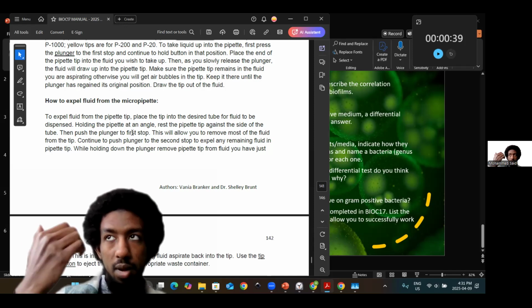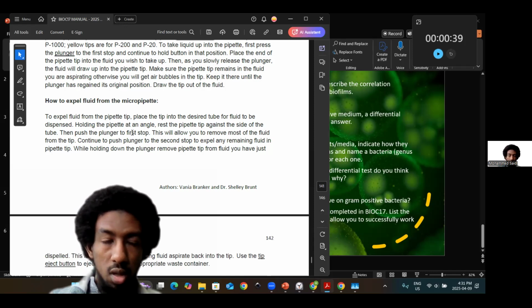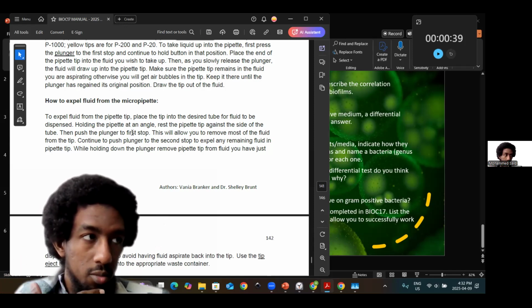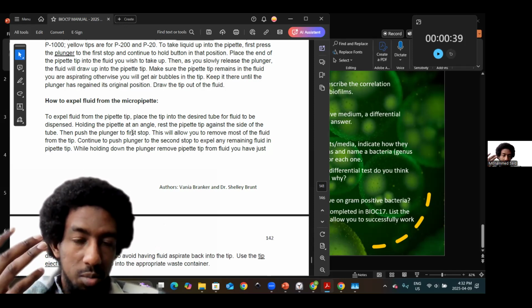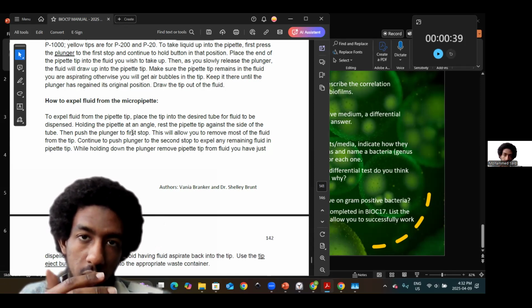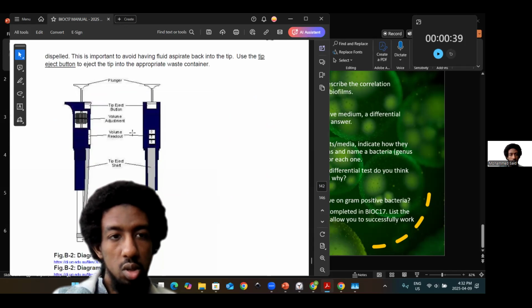And then when you go up, be it to inoculate, always remember aseptic technique: with your tips, closing the tip box with your lids, flaming your tubes, flaming the lids, even for your beakers and flasks that we've used for generation time, or even the necks of the glass pipette canisters, like the bore pipettes. I want you to consider these and even the plates, keeping them close by. They're not going to melt beside the Bunsen burner, but bear in mind that you don't want an open exposure, just like with a UV analysis. So I want you to think about that.